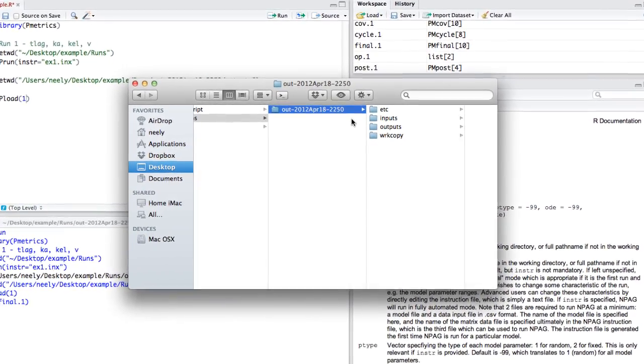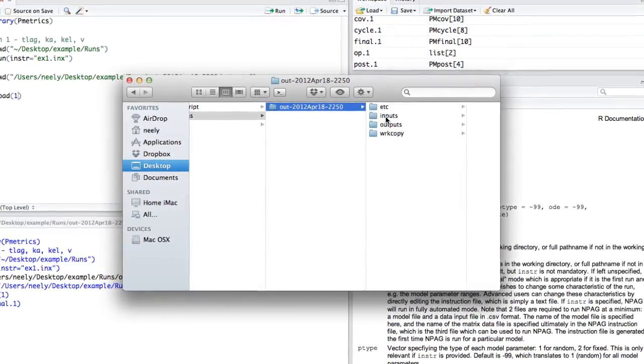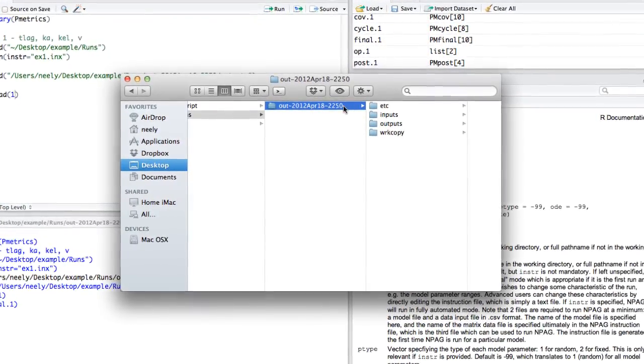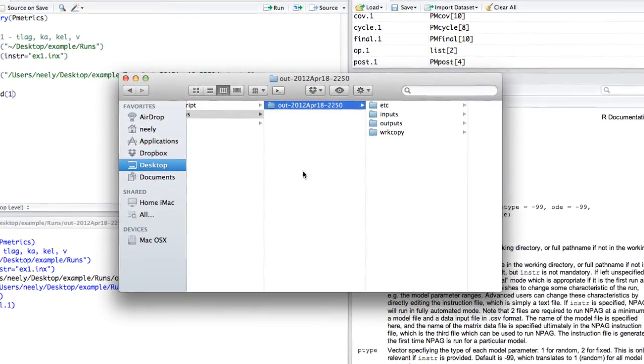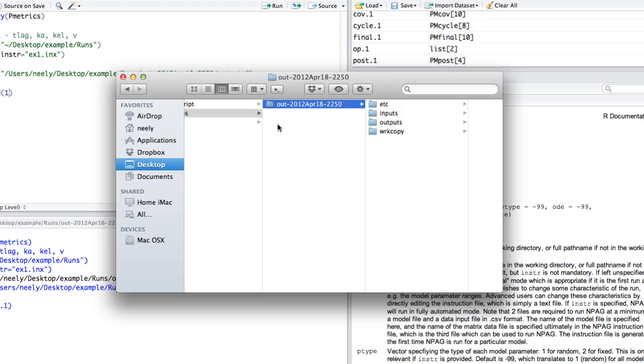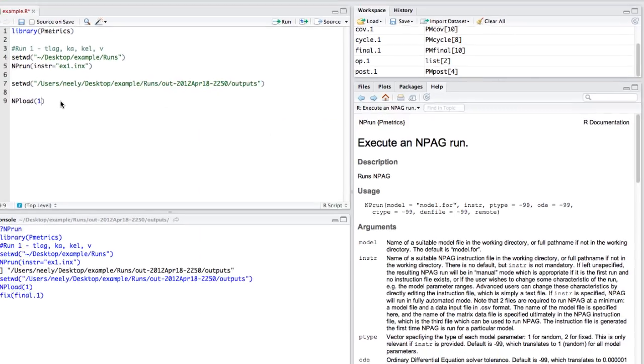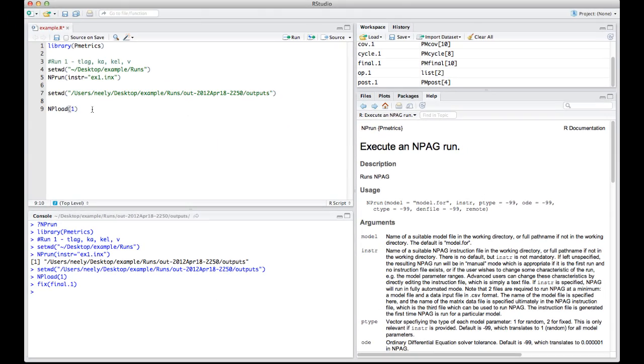If we want to do another run, we would simply grab the input files or other files, drop them into the runs directory, go back to PMetrics, and begin with the same process again. That's it for now.